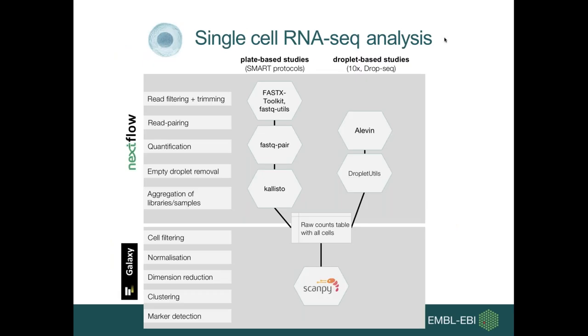So this is our analytical pipeline. At the moment, we can process both plate-based and droplet-based studies or experiments. But the upstream processing obviously has to differ a little bit between these two types of experiments.